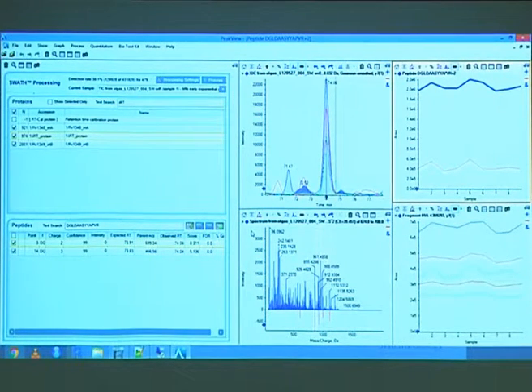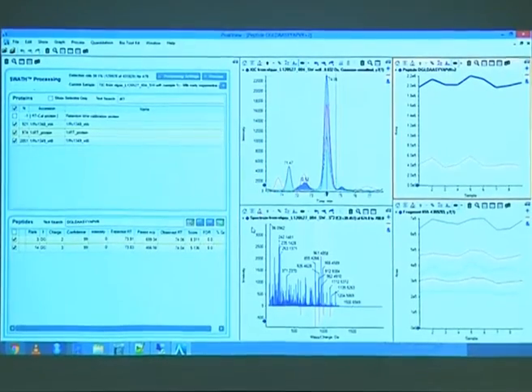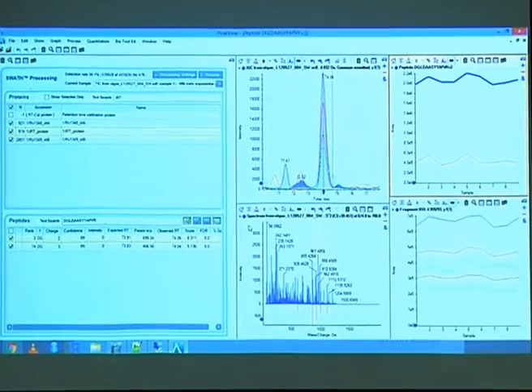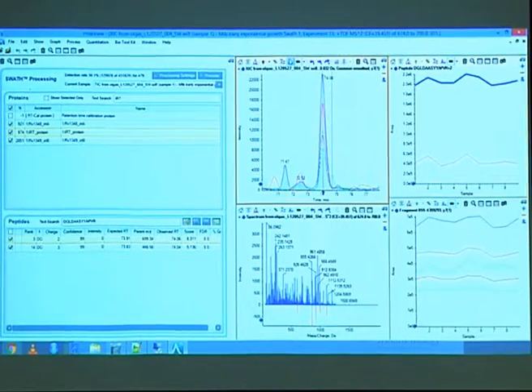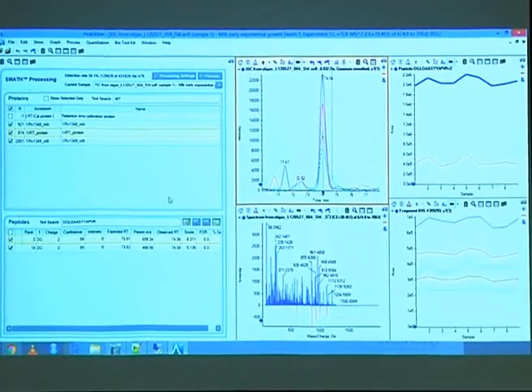What you can check as well is, if you have one peptide, you would think that the dynamics across the different files are the same for the 2 charge states. You would also expect the retention time to be the same, since you have the elution from the LC and then the charge gets added. So the retention time should be the same. In this case, you see 74.06.